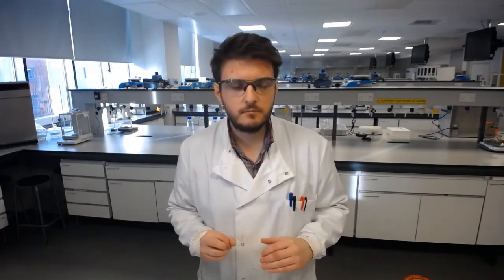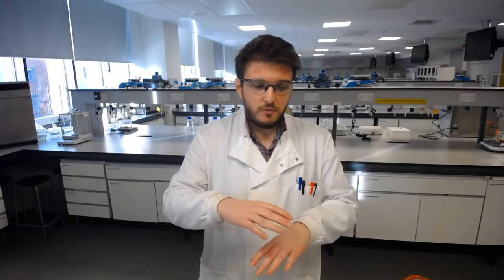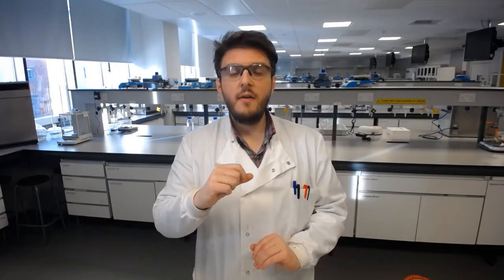So what's better, generally, is if we can say, well, okay, the formulation may slightly split and we may have some sedimentation, but if a patient is able to just shake that formulation and it becomes homogeneous again, it becomes the same all the way through again, then that's okay. That's better than caking. Ideally, we don't want it to fall out of solution at all, but if it's going to, we'd rather that it was a very loose falling out of solution that can be redispersed very easily with simple shaking.